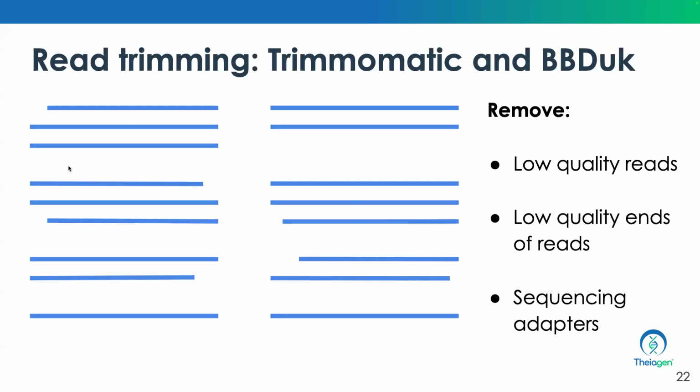For a given sample, you'll notice some have disappeared. That simply means that as you are trimming reads, you have a cutoff for the mean average score for that whole read. So for certain reads, you might keep on trimming until it reaches a point where the length of the read now falls below your expected read length.